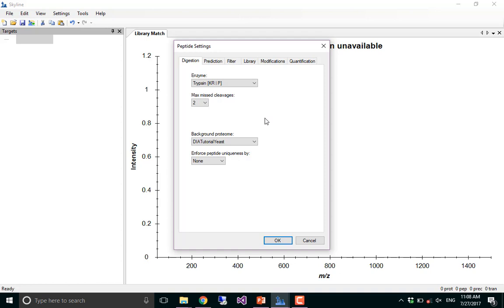It just turned out that trying to teach everybody how to do everything from settings was blocking people, and they were feeling like, where do I start? So that's why we created the wizard. There's nothing about the wizard that you can't achieve if you're an expert with settings.